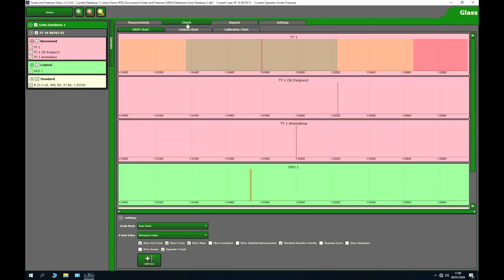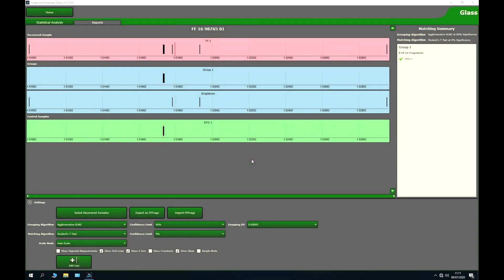Control charts allow visual comparison of the different fragments across the refractive index range. We can also analyse results statistically using the included software, where the recovered samples are broken down into groups and those groups are compared to the control. In this case, we have a match from the recovered to the control sample.